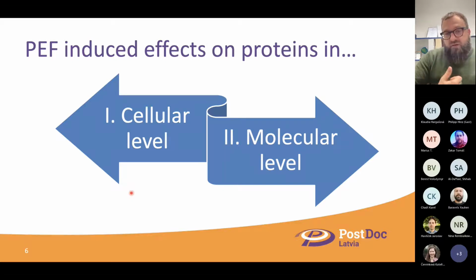What this means is that it is very interesting how a PEF-induced effect on proteins can be seen or investigated in a cell.